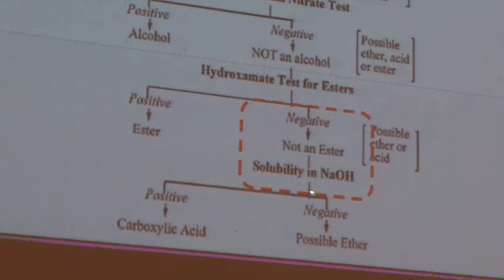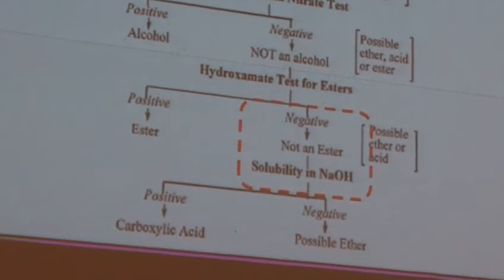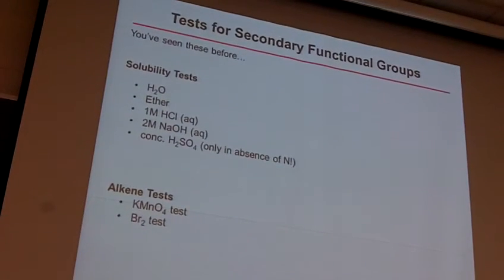So the last thing is the solubility test. When you get all the way down here, you want to know, is it soluble in the sodium hydroxide or not? An ether is relatively non-polar, 2 carbons on the oxygen, that won't dissolve in sodium hydroxide. If it is soluble in sodium hydroxide, that means you're deprotonating it and making the carboxylate, and that is the positive test, and that means you have a carboxylic acid. And so with that, you've now made it all the way down and you figure out which functional group you have. So that basically covers the primary functional group.